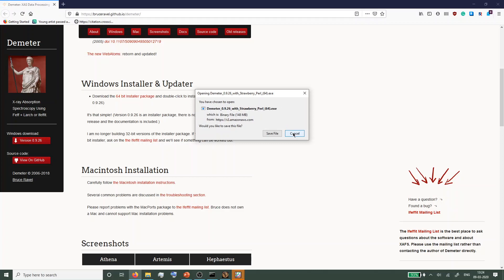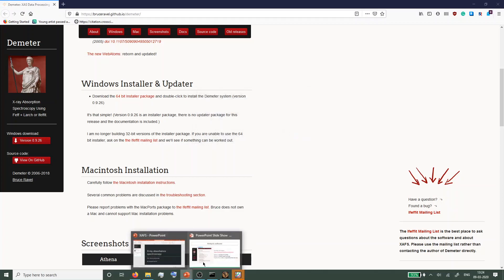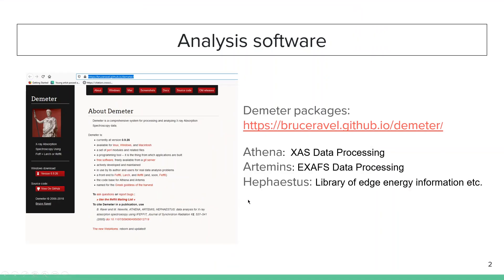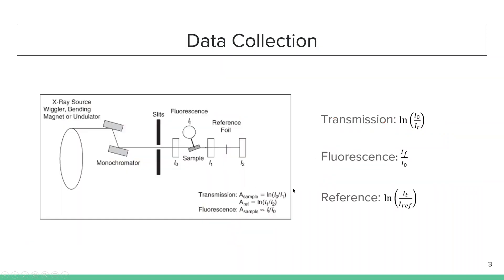This package will install three programs. First is Athena for pre-processing and doing basic XANES analysis. Then there's Artemis for EXAFS modeling and data fitting. And third is Hephaestus that contains the library of edge energies and a bunch of other stuff.